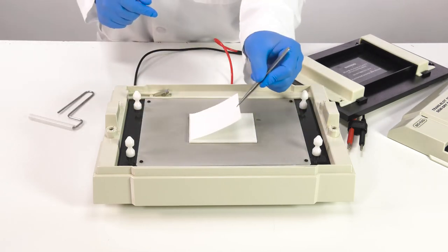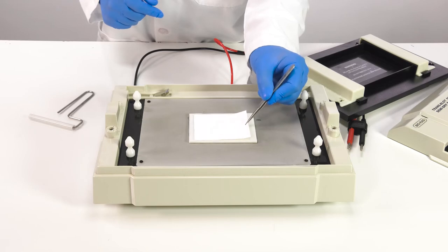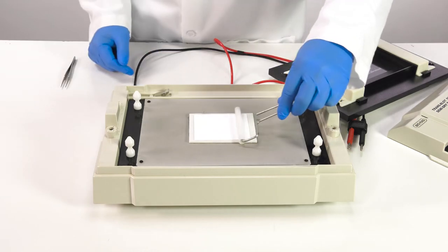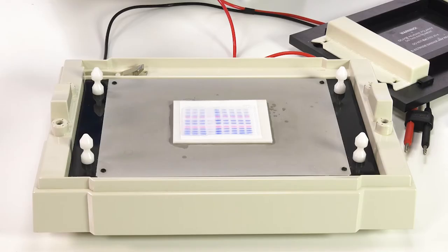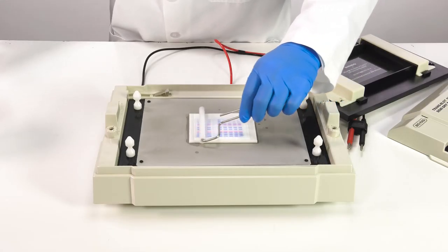Next, place the pre-wet membrane on top of the filter paper. Roll out any air bubbles. Carefully place the equilibrated gel on top. Make sure to minimize movement of the gel on the membrane to prevent ghost bands. Roll out any air bubbles.